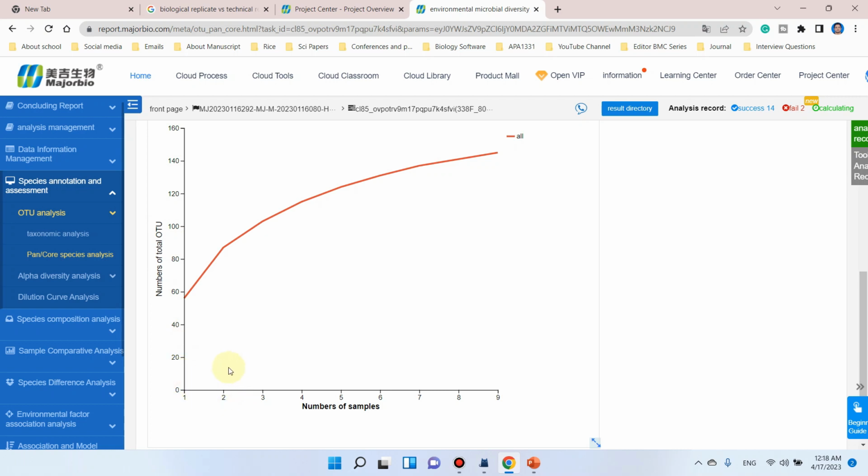So it means actually the control negative has the lowest number of closely related sequences. But when we talk about control positive, you can see the number of operational taxonomic units which were associated with one another increases. And if we talk about the management group, we can see the number of operational taxonomic units is increasing as we deal with the management group.